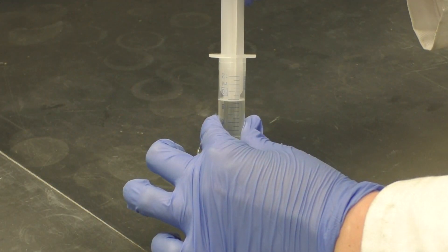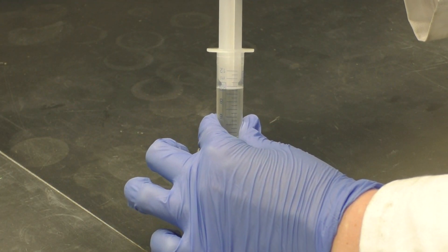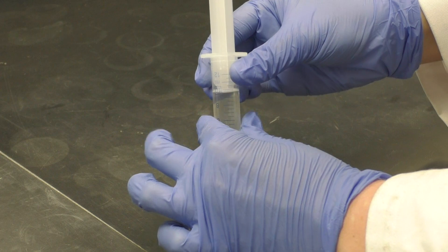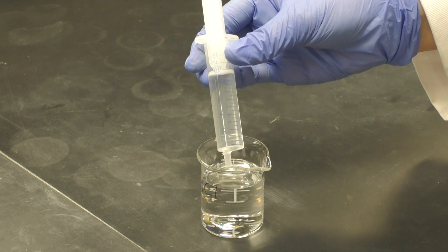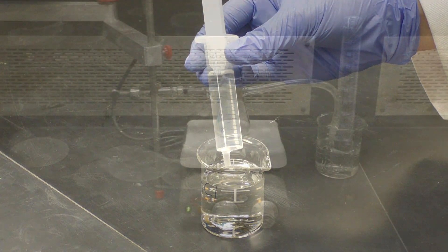To run your reaction, you will need to draw 10ml of hydrochloric acid into a plastic syringe. Be careful not to draw up any air bubbles while you do this.